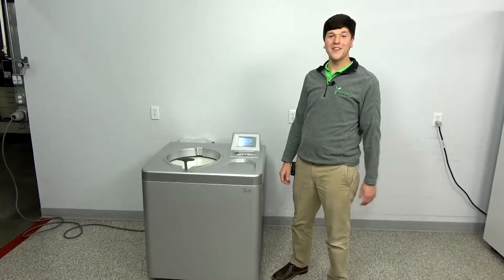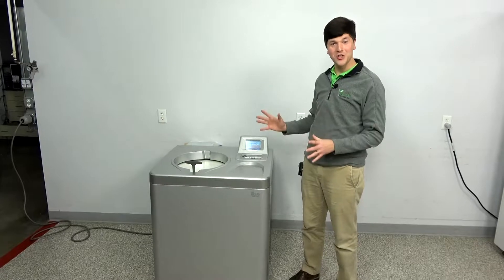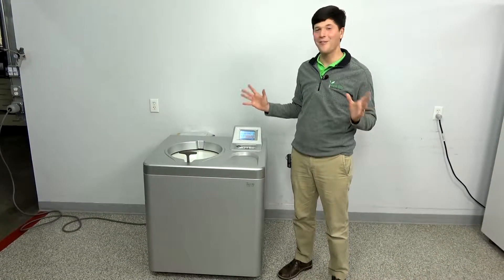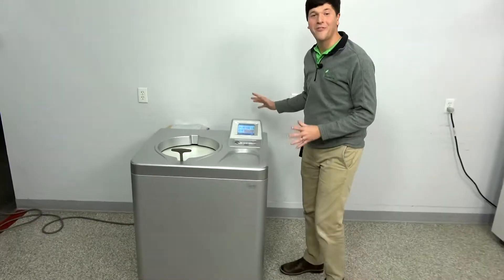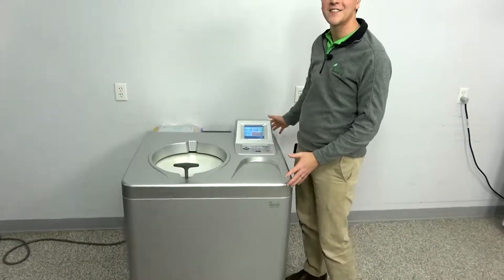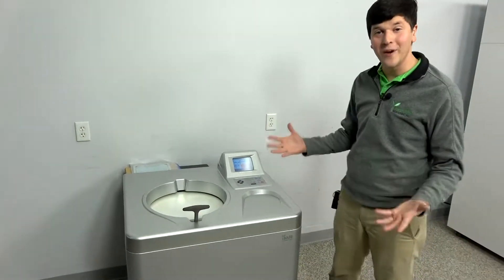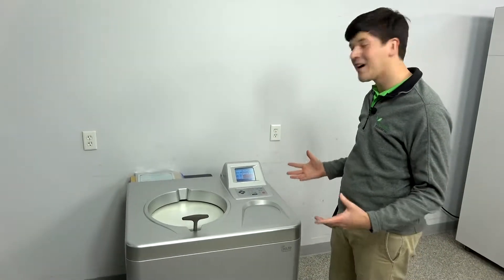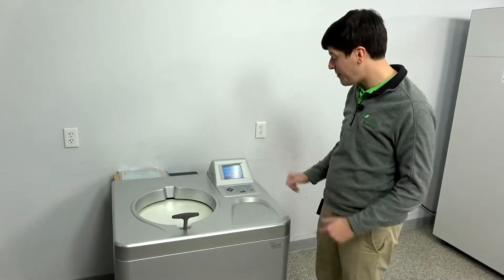This is Nathan at New Life Scientific. We're going to take a look at an unused Thermo Fisher Sorval WX80. There are so many names — can't Thermo just truncate it a little bit? But this is a pretty unique find on the used market because it's really not used. It's essentially a new instrument that sat around for quite a while waiting for a caring company like us to pick it up and polish it up a bit.